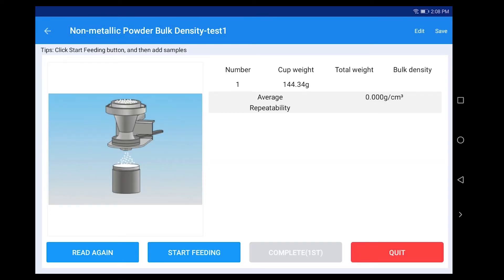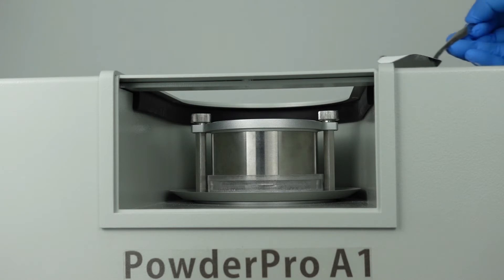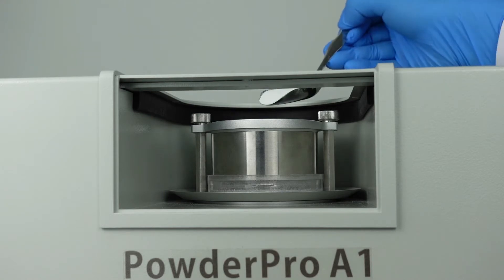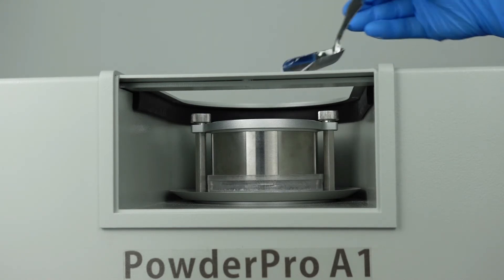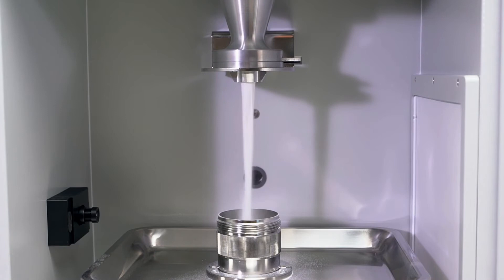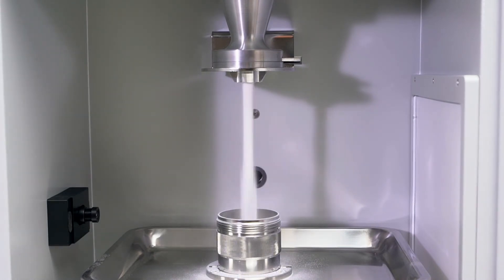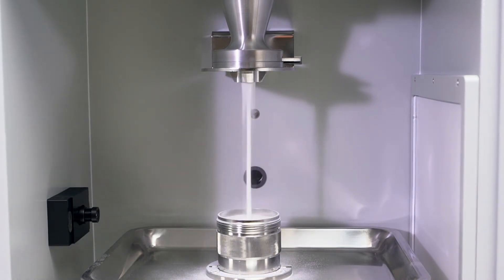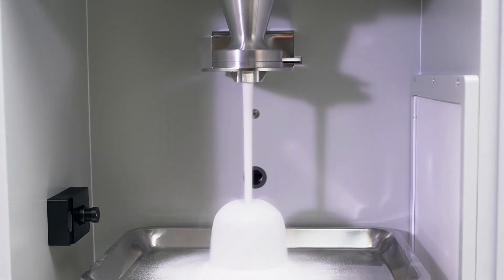Click Start Feeding. Use the sample spoon to slowly drop sample through the sieve and the funnel into the non-metallic powder bulk density container in the stock pan. And stop feeding when the sample fills the container and overflows.